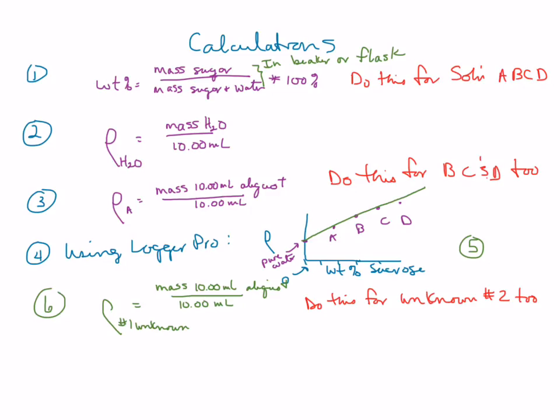So I'm going to pull up Logger Pro. Now, if you hear me lapse and call it graphical analysis, that's what it used to be called. So it's been Logger Pro for a few years now. It's a nice program. Pretty much all of what we do in Logger Pro, you can also do in an Excel spreadsheet with graphing, but I really prefer Logger Pro because it has some advantages, I think, with bringing in our Vernier data from our LabQuest units. So any questions about that?